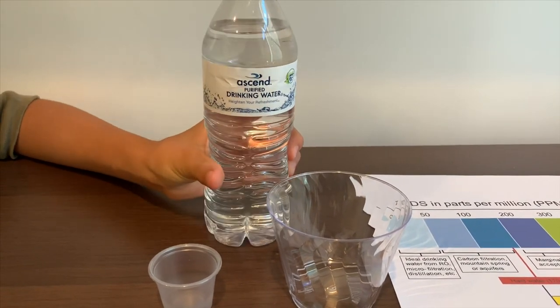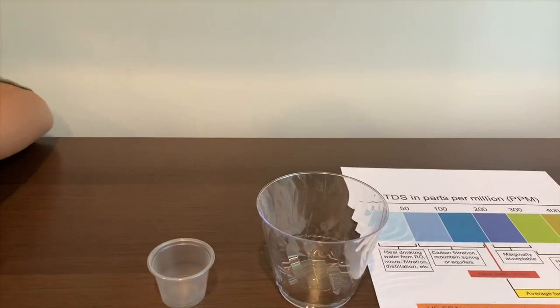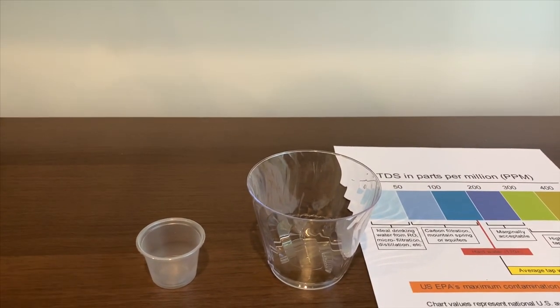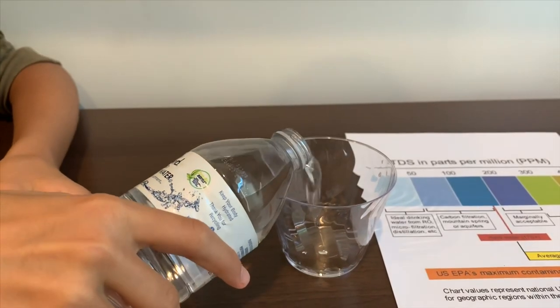This is Ascend purified drinking water, and it has electrolytes for taste. Let's pour some water in. It does not pour too much, and it costs 99 cents.